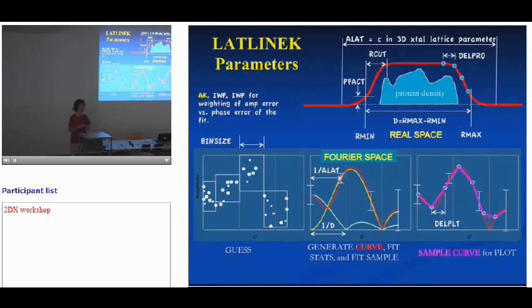It has to be, as Richard said, that it needs to satisfy the requirement for the Patterson function, and of course it needs to be bigger than your envelope. You can imagine that if you make it smaller than that, even if you fit it, it's like cutting it off and trying to put another one of the same thing on the next unit cell. So that's not going to work either. Those are the important requirements.